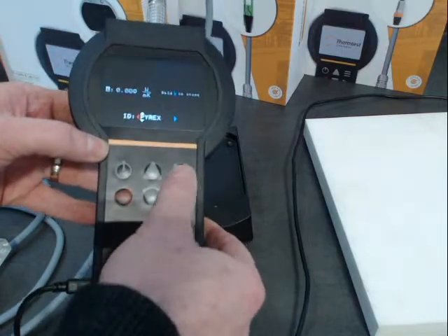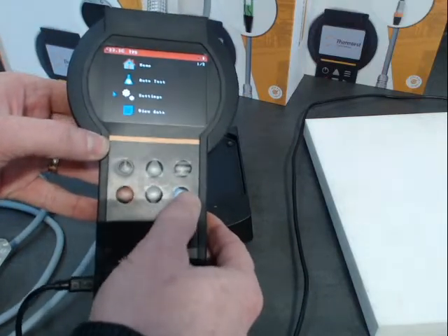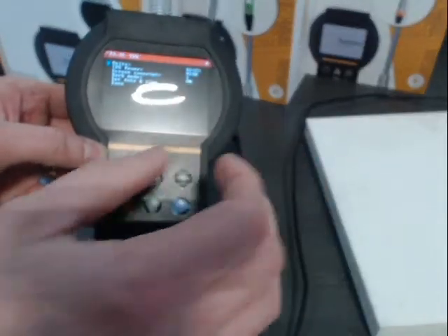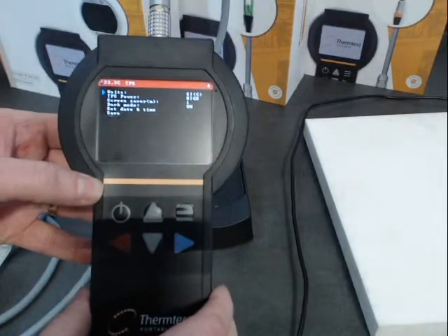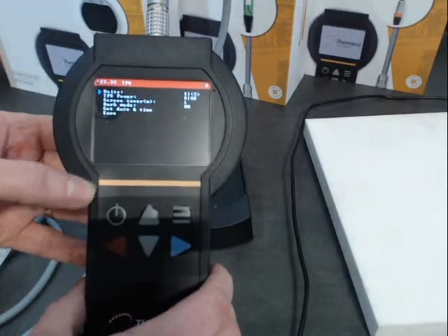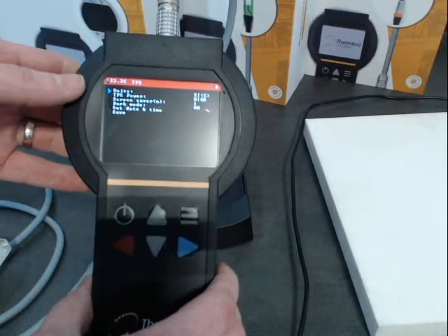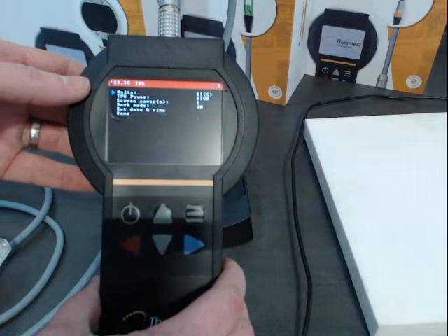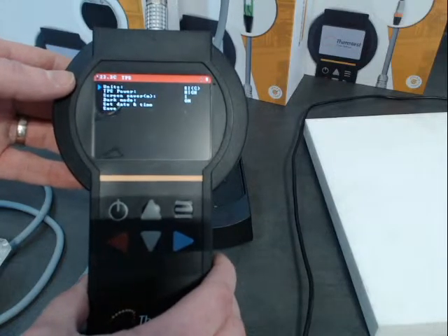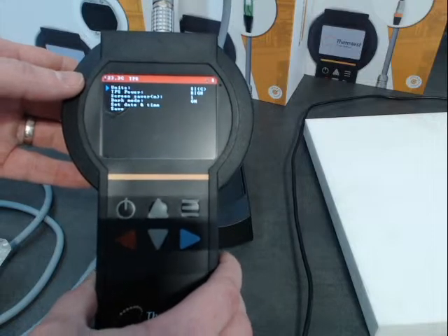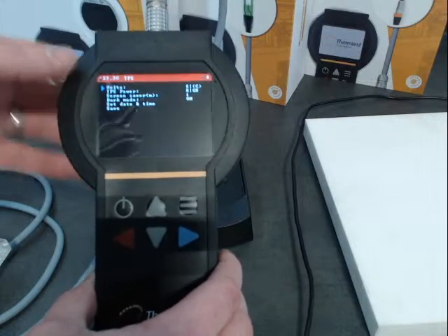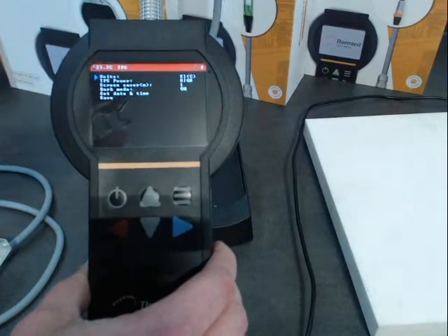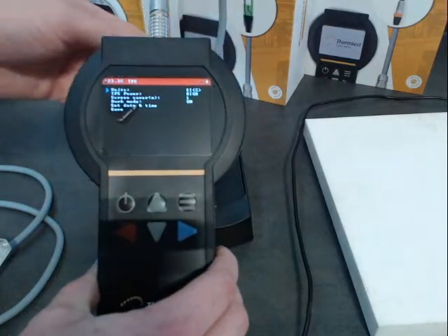There are two power settings. It is now on a high power setting that automatically changes the test time as well. There are low, medium, and high. Generally for materials below 0.1 W/m·K, you use low power and that's a 40-second test. Medium is medium power and a 20-second test. And high power is high power and a 10-second test. So this measurement would be 10 seconds.